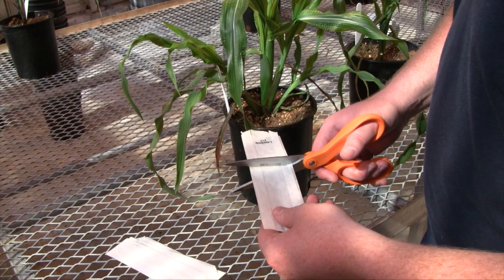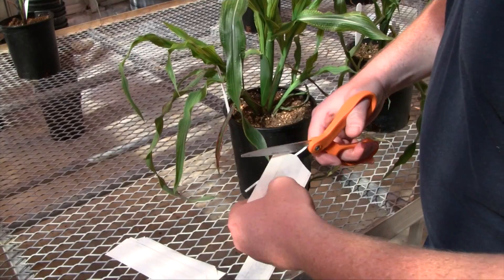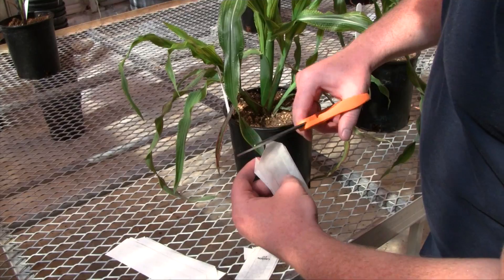Full-size earshoot bags are too long for mini maize. To adapt earshoot bags for mini maize, cut them approximately in half. Next, cut the open end of the earshoot bag to resemble an exaggerated version of the original tab.